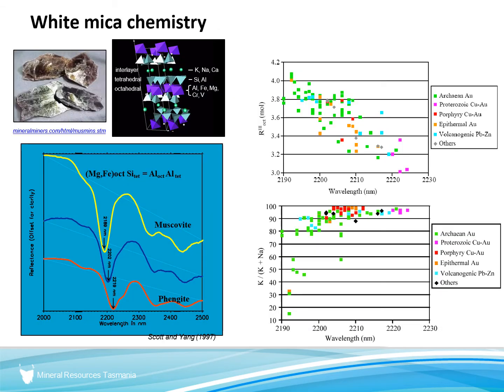So a typical purpose for the shortwave infrared, the absolute classic, is fingerprinting the composition of the white mica using the feature which is located at 2200 nanometers, which moves from shorter to longer wavelengths as you go from aluminium rich to iron, magnesium, silicon rich. And the calibration, it's not perfect. So we really do rely on the power of oversampling of the HyLogger to sort this out.